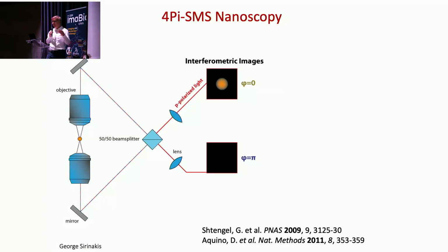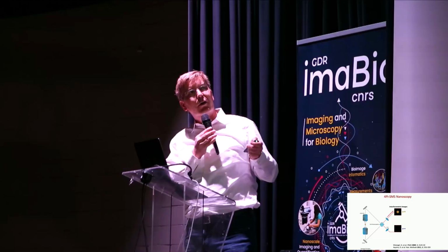As a physicist, I'm always really excited about this because we are really seeing here the interference of single photons getting emitted from that one molecule, because fluorescence itself is incoherent. So it must be a single photon interference that we see here, and then added up over many, many photons, we get that interference effect.